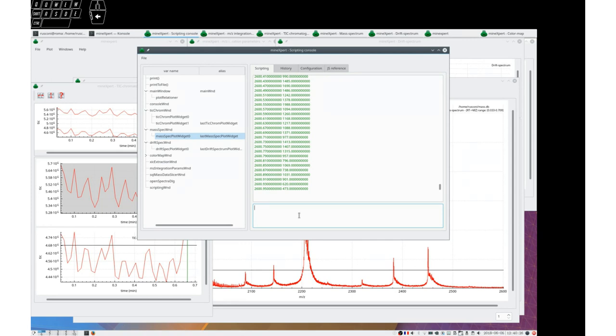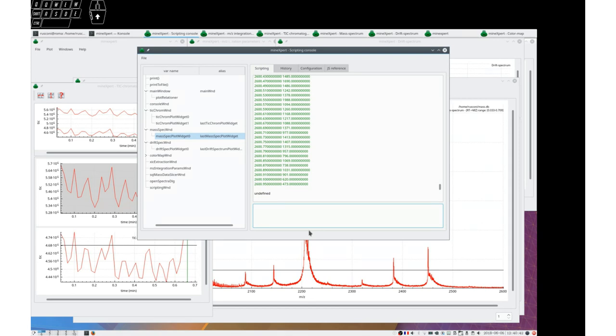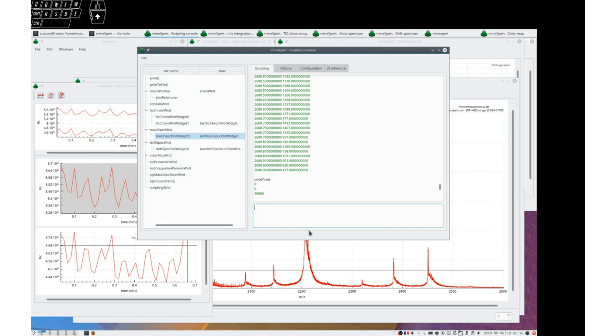I could also say var MS zero equals mass spec plot widget dot mass spectrum. In that case, I have a true mass spectrum object. I could ask for the length property. And I know now that there are 38,666.